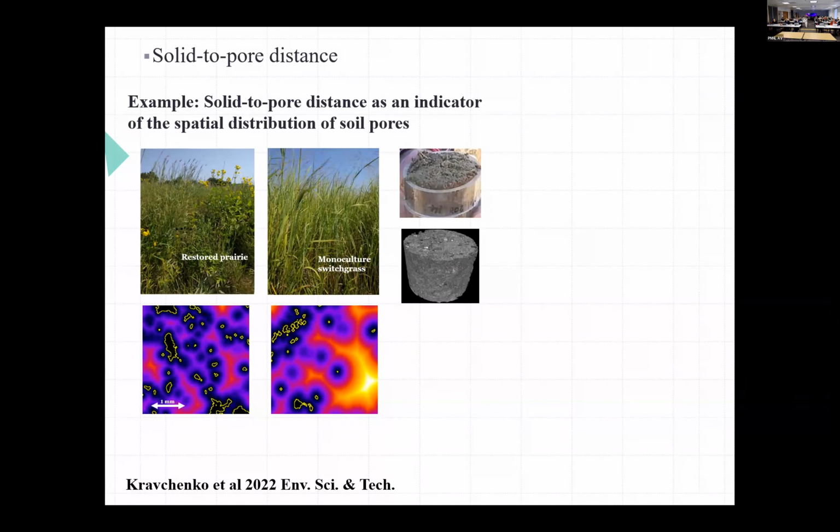And with a resolution of 18 and pores that we see of basically some 36 micron diameter, we can realistically say these would be typically air-filled pores. And the colors represent distances. How far is the soil matrix from those pores? The blues mean that the soil matrix is close to the pores. Oranges and whites are the soil matrix that is far.